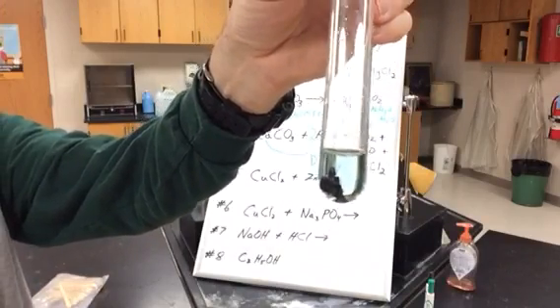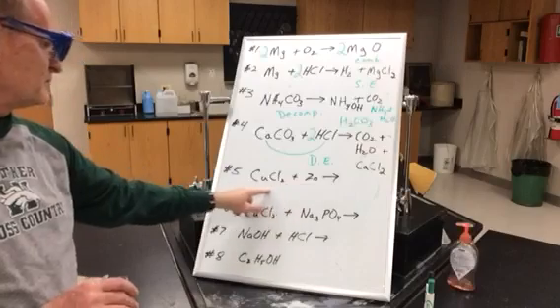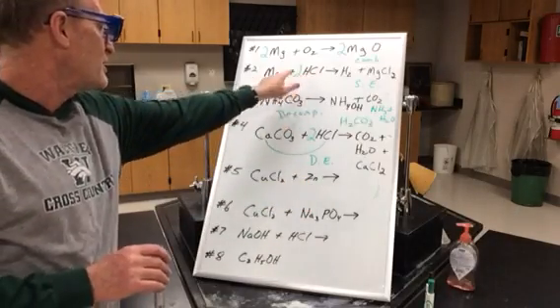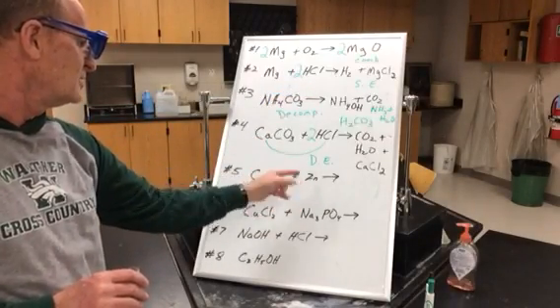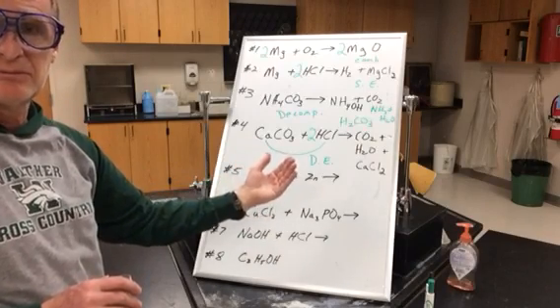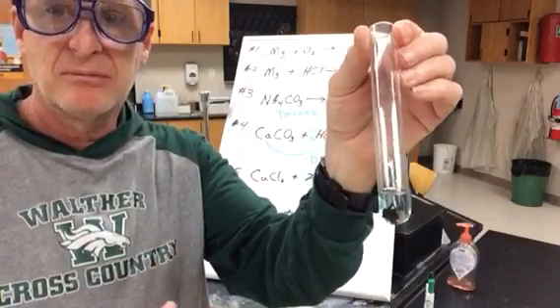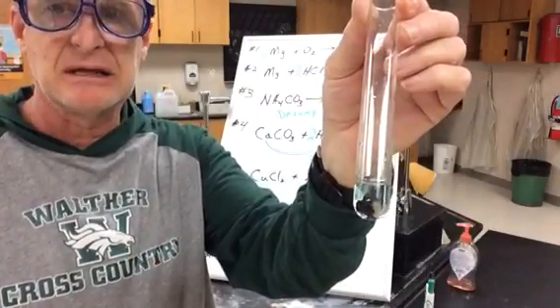of the zinc. And I don't know if that looks familiar to any of you, but if you look at my reaction, this looks like it's going to be a compound with an element. So that's very similar to a compound with an element, a single exchange. If I get an exchange here, the zinc and the copper switching places, I should have copper metal being produced. If you remember from other reactions, or think of the color of a copper penny, it's that dark reddish brown brick kind of color. And so yes, I do have some copper being formed on the outside of my zinc.